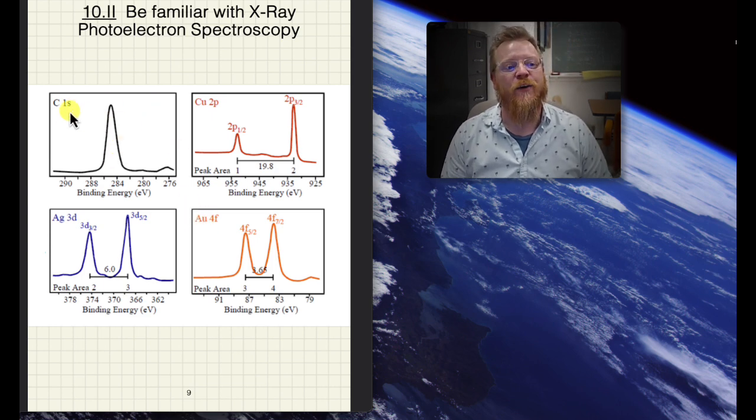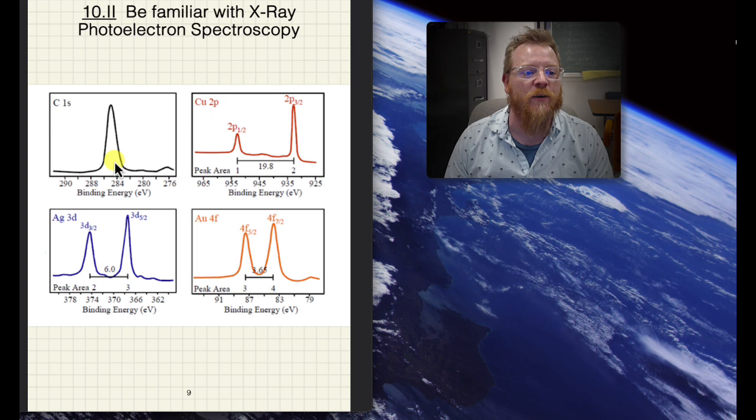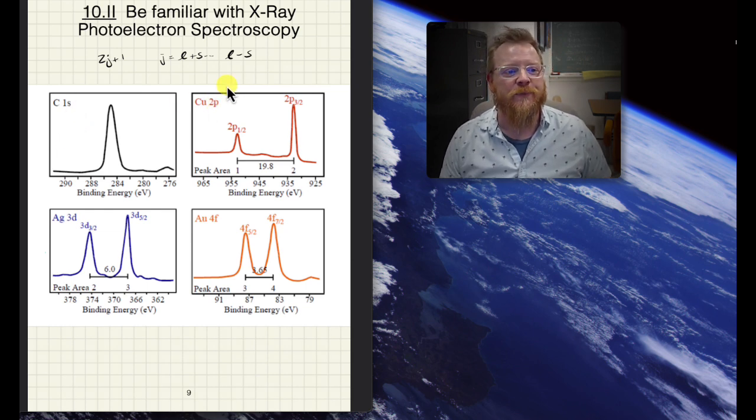One, we can see here for elemental carbon, we get a nice peak in the vicinity of around 285 electron volt. And notice that there is only one peak. Recall the degeneracy goes as 2J plus 1, where J takes on all values from L plus S all the way down to L minus S. In the case of S orbitals, L is equal to 0, and S will be either plus 1/2 or minus 1/2. So we don't get any splitting from this S orbital. However, when we look at the 2p or 3d or even 4f, we do see splitting.